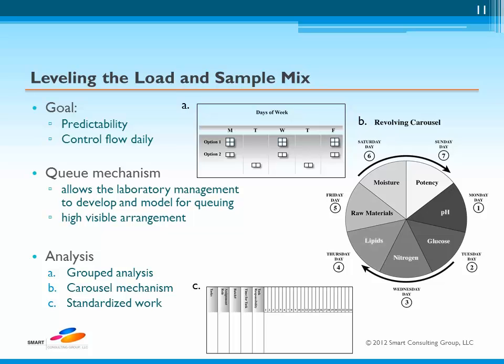Group analysis for a moment. Perhaps the easiest to implement is a grouped analysis, where similar or compatible analyses can be linked and performed together because of a logical connection.